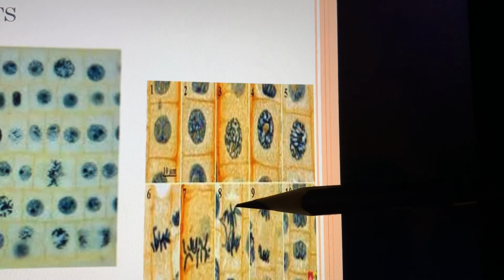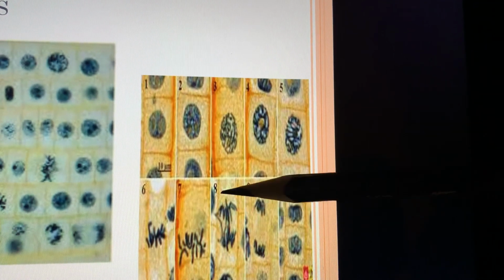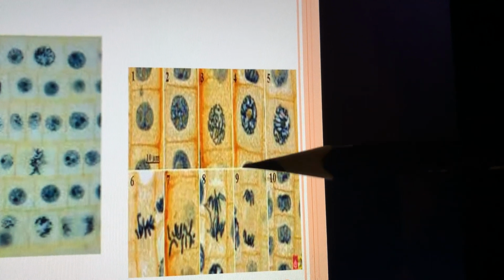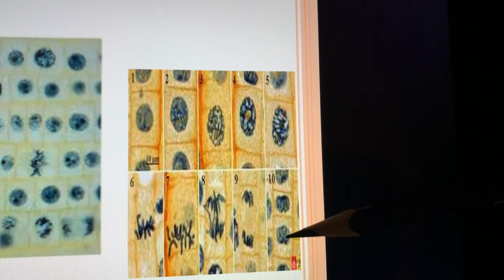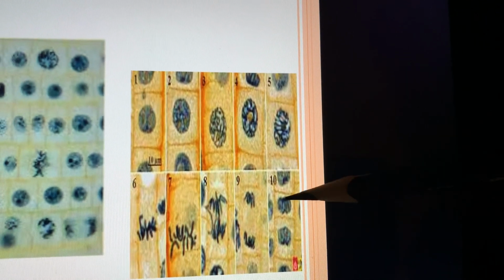This is the one I need you to concentrate on. Look how each set of chromosomes is going to each part of the cell. This is late anaphase, and at the end there is a plate being created over here to separate the two cells, and now the chromosomes will bind together with a nuclear membrane, creating two cells.